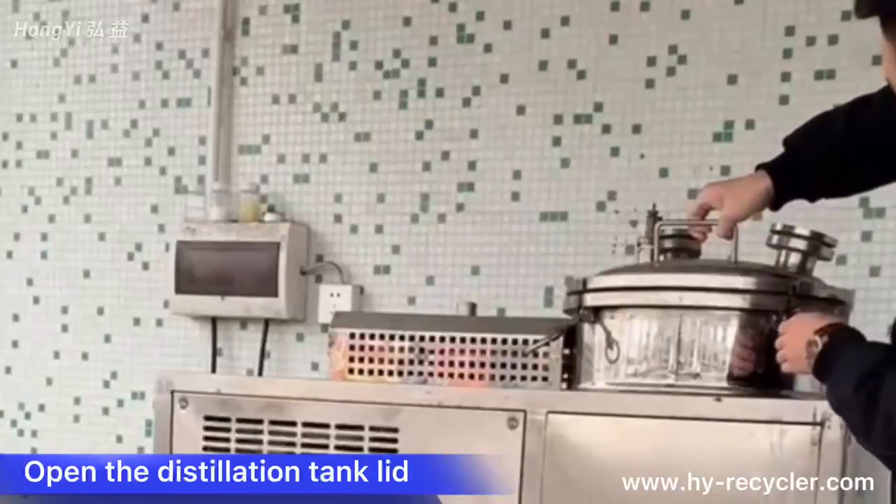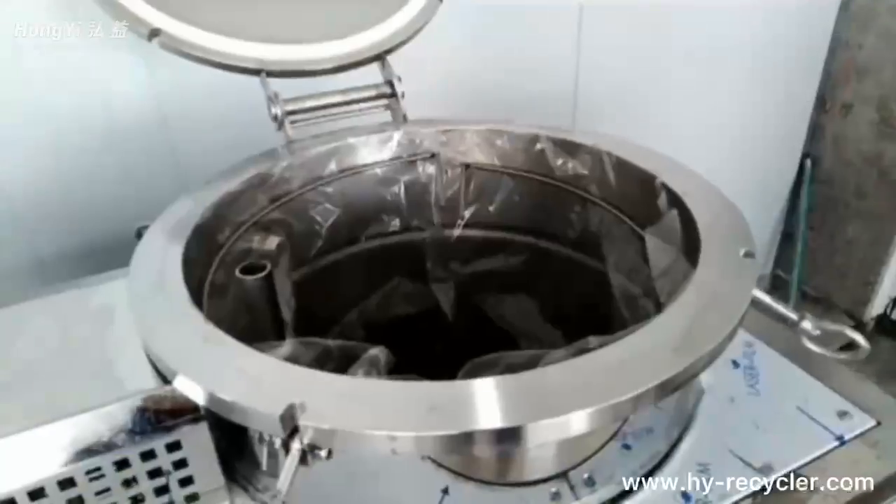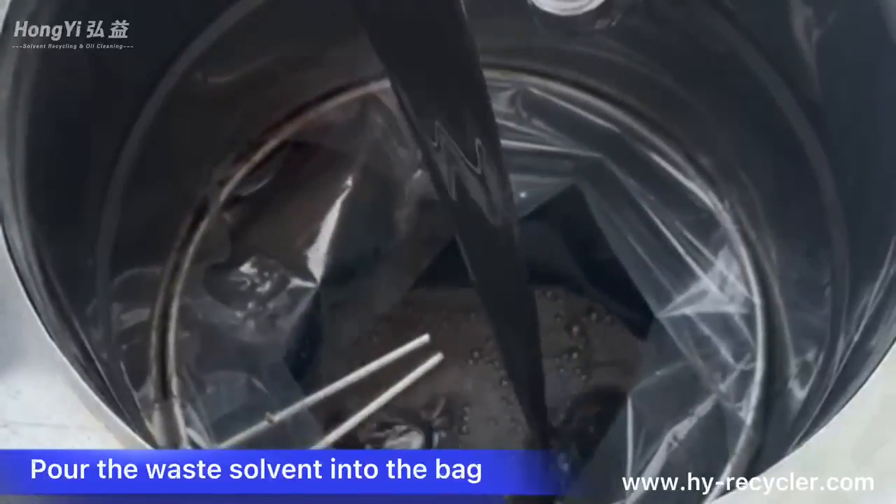Open the distillation tank lid. Put the recycling bag into the distillation tank. Pour the waste solvent into the bag.